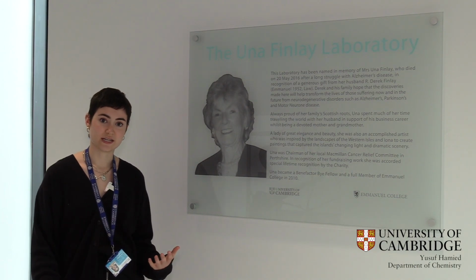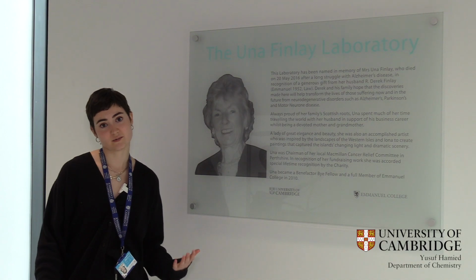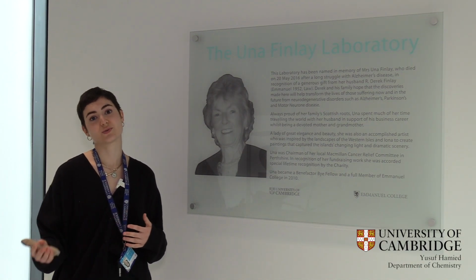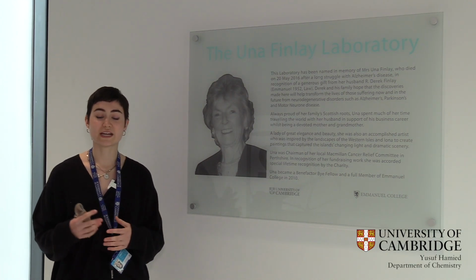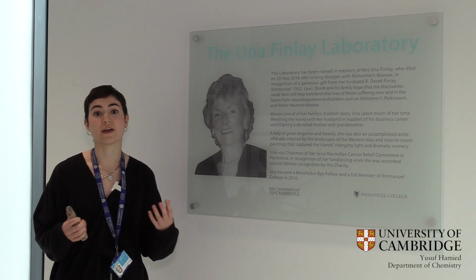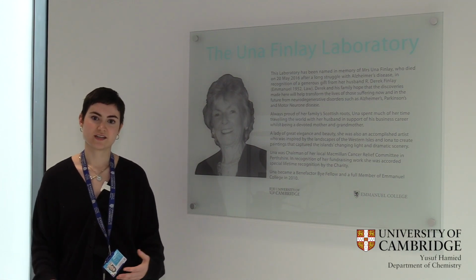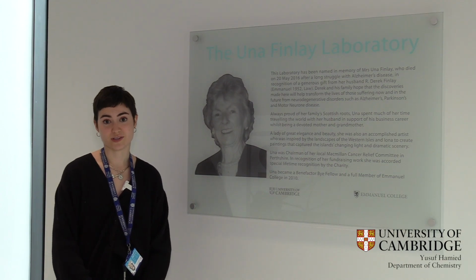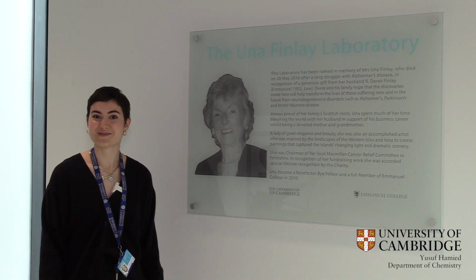So what we try and study here in the Vendruscolo group is two things. We try and understand the mechanism of how this aggregation happens, but we also try and understand how we can treat or prevent this aggregation. So we do things like small molecule or antibody design that can specifically target these proteins to prevent them from aggregating and misfolding, thereby preventing the disease. And so ultimately what we're trying to do here is to develop treatments for these neurodegenerative diseases. So now that you guys know what we do here, how about I show you the lab?